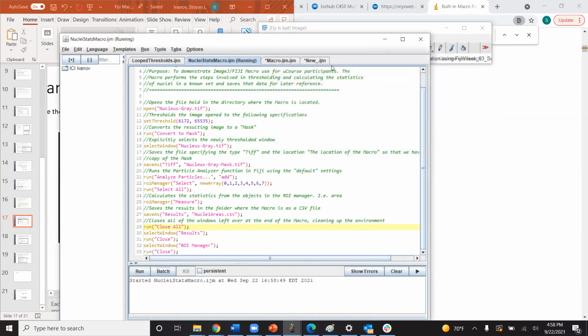And that's it. It took us maybe about a minute to run the analysis by hand. It takes just a couple of seconds to run it as a macro. So it's quite an increase in speed. And once you've proofread your code and it works, that's the big if, it's quite a lot less hassle.